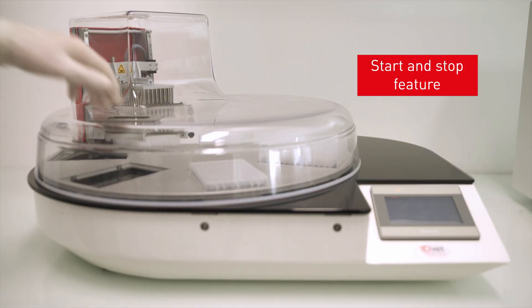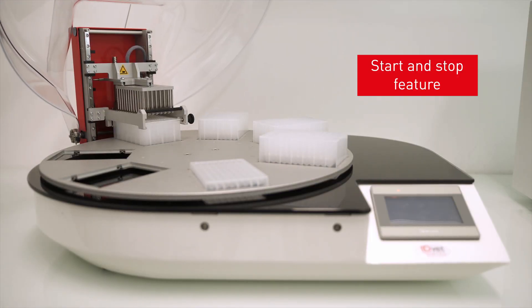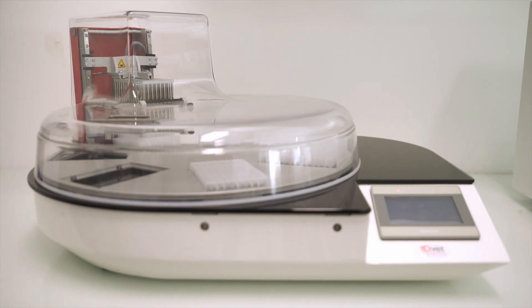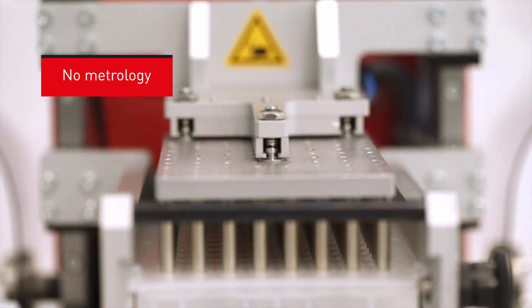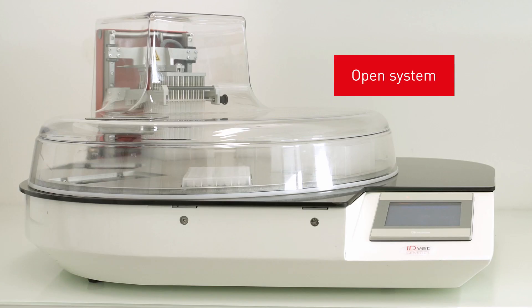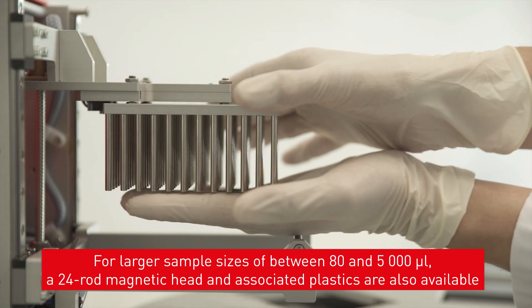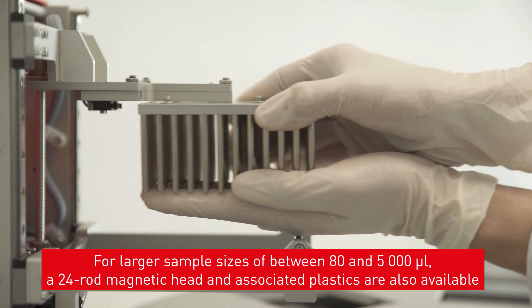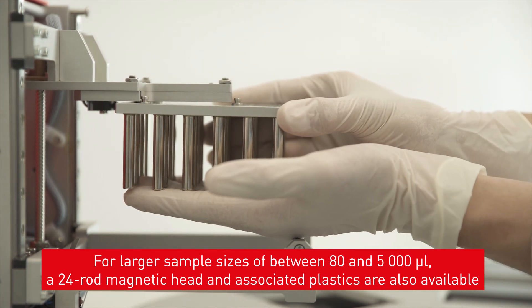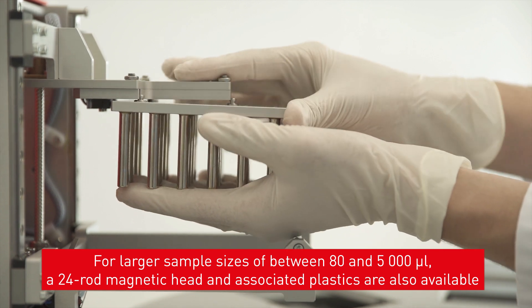A start and stop feature allows you to resume the program if the machine is stopped. The Ideal 96 robot is a robust tool which does not require any metrology. The system is open with the possibility of simple programming and the robot is CE certified. For larger sample sizes of between 80 microlitres and 5 millilitres, a 24-rod magnetic head and associated plastics are also available.